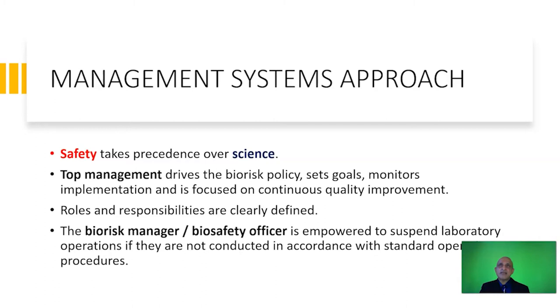The second aspect is that top management drives the biorisk policy. Top management is accountable and responsible for driving the biorisk policy across an organization. They are responsible for setting goals, monitoring implementation, and, very important, continuous quality improvement. This forms the foundation of biorisk management. The roles and responsibilities of everyone in the organization are very clearly defined, right from the top management to the biorisk manager or biosafety officer, right down to the level of the cleaners and the waste disposal personnel. Everyone's roles and responsibilities are clearly defined.